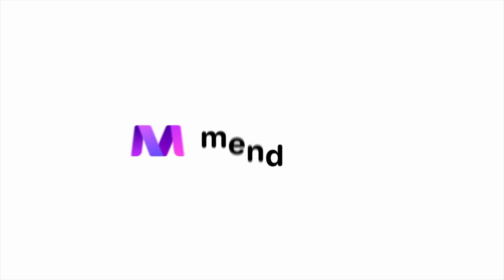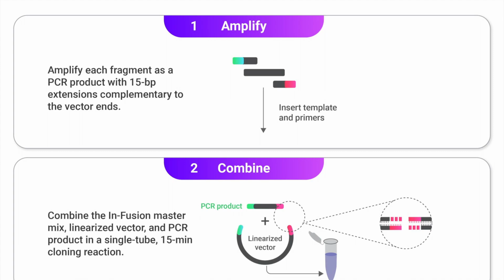In this video, we will show you how to simulate infusion cloning with a single insert fragment on Mendelgen. Infusion cloning is a homology-based cloning technique. First, the backbone and insert must be linearized, and then using PCR, both of the fragments are amplified. The PCR primers for the insert have overhangs, so the backbone and insert will have overlapping homologous ends.